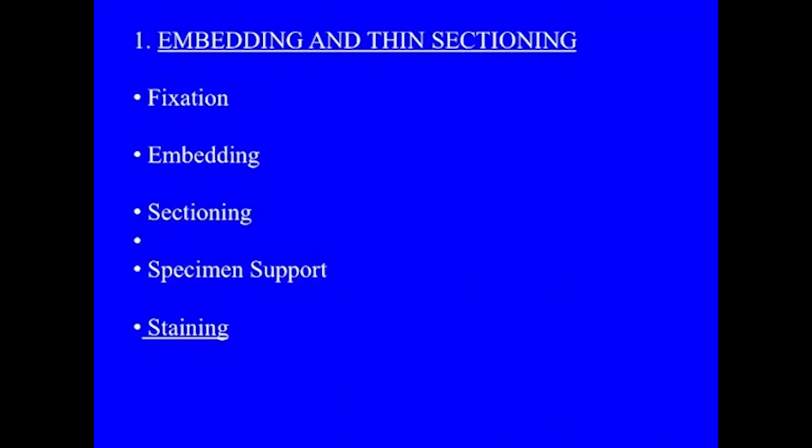Now, after fixation many times samples may be treated with solutions of heavy metals. Now, this is not a staining as such; you are trying to provide more and more atomic density for scattering, and this is not compulsory here. Uranyl acetate and lead aspartate plus bismuth subnitrate can be used as block staining reagents here. So, after fixation the embedding is done.